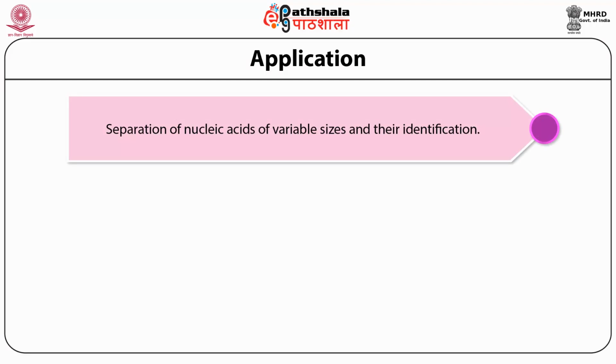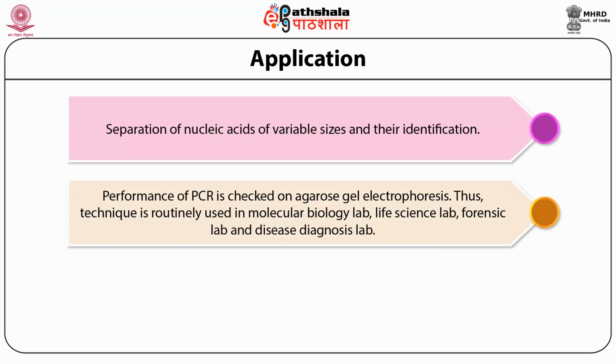This technique is used for evaluation of PCR, that is the polymerase chain reaction. Polymerase chain reaction has wider applications. Name any field, we find the application of PCR, whether it is for resolving the issues of crime, whether it is for resolving the issues of paternity, whether it is required for cloning an expression of a particular gene for making a desired product, whether it is required for targeting a gene, any applications we name for the PCR reaction.